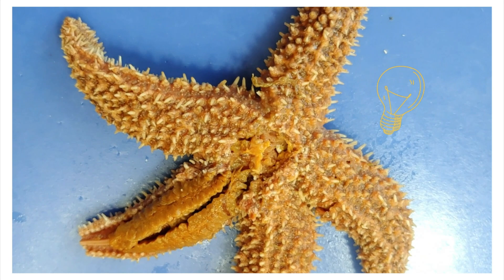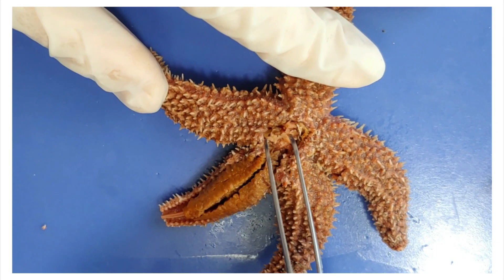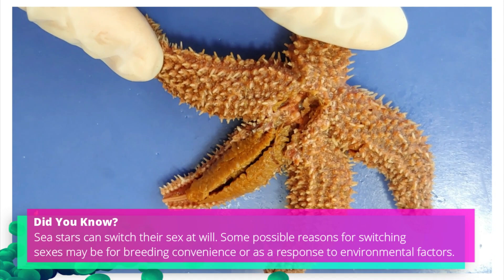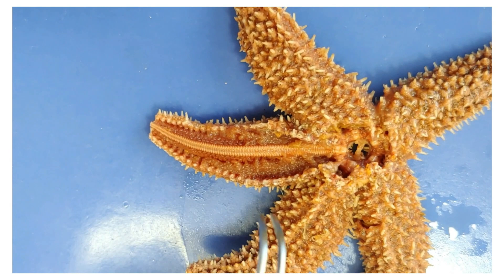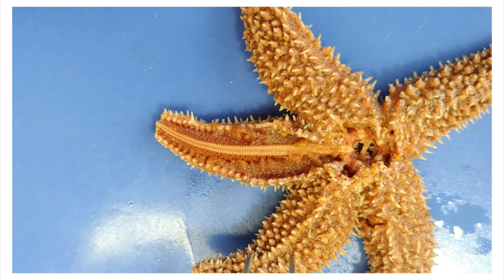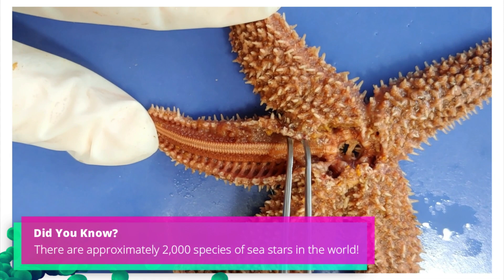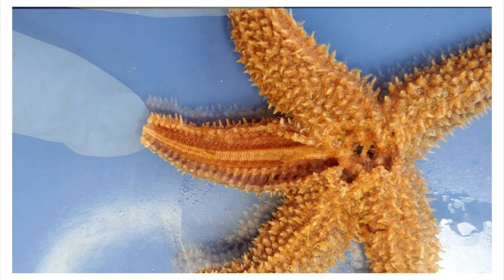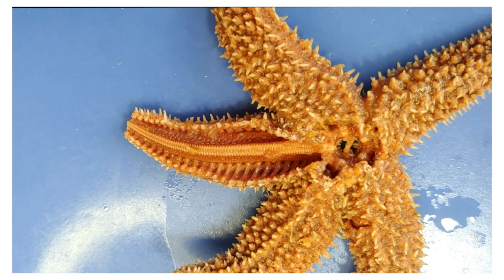Now I'm going to remove the digestive system structures so we can see what's underneath. Here in each radial arm, below the digestive glands, are the reproductive organs — there are two in each radial arm, near the central disc. Sea stars have either male or female reproductive organs, but you can't tell because they look the same. Sea stars can also reproduce asexually through a remarkable regeneration ability. If you tear a sea star into five pieces, as long as each piece has a part of the central disc, you'll end up with five sea stars.